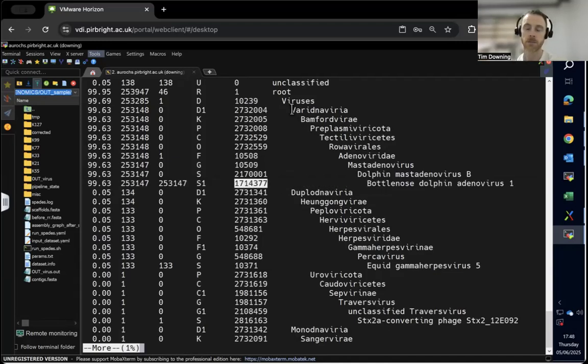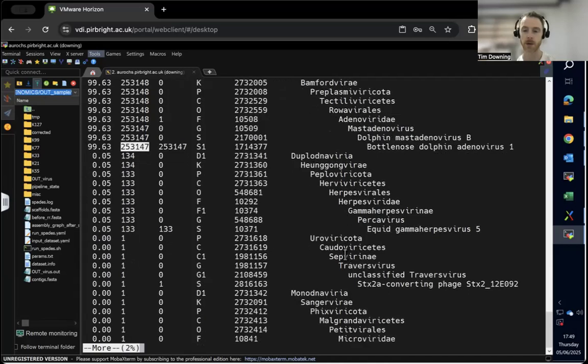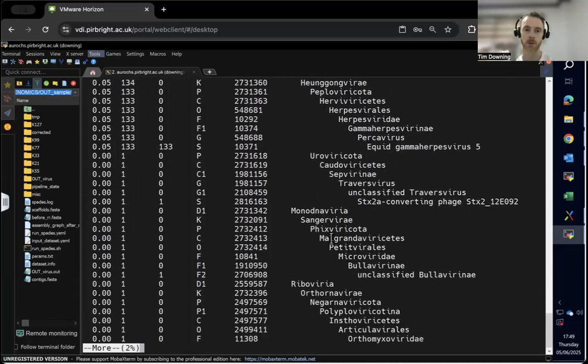And you can see the lower taxonomic context of that particular virus. You see there's a few other things in there, gamma herpesvirus, but this is a very, very low level of reads in contrast to the adenovirus above. So maybe present and maybe contaminant is a bit at this ambiguous level. And you can see after here, once we go down to read match level 1, this is just definitely noise. So that's our Kraken report and output.